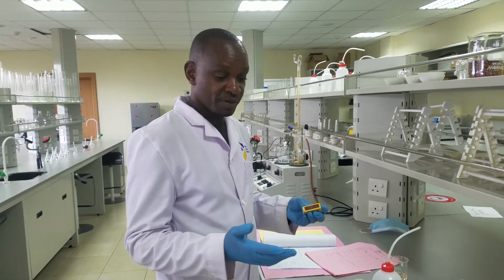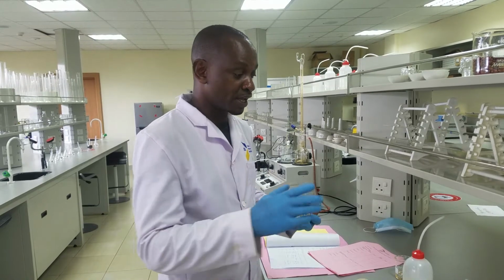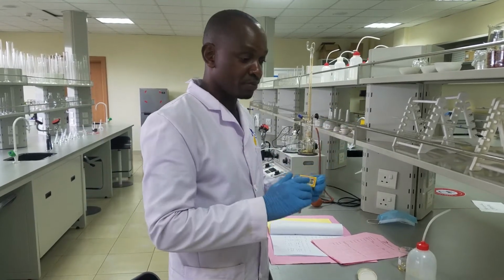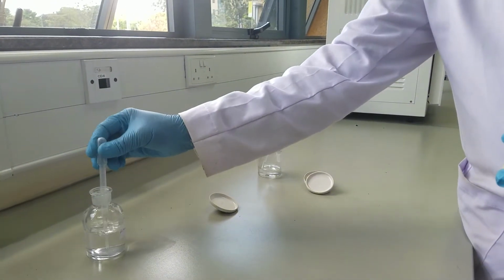Again, carefully, this is an experiment that is dangerous in the lab. So care must be taken when you are carrying it out, because remember, hydrocarbons are flammable. And since they are flammable, we need to carry them out near the window so that most of the fumes can go out and don't accumulate in the lab. So for this reason, I'll take my combustion next to the window and I'll perform this experiment for you to see the soot. I will start with heptane to do the combustion.